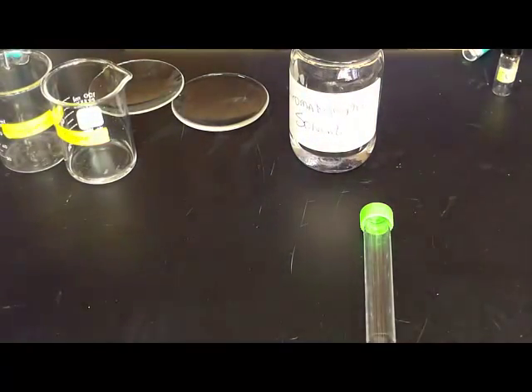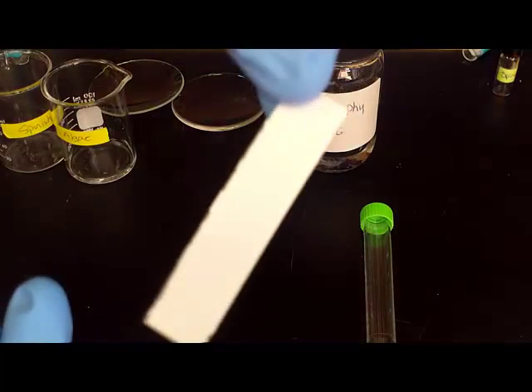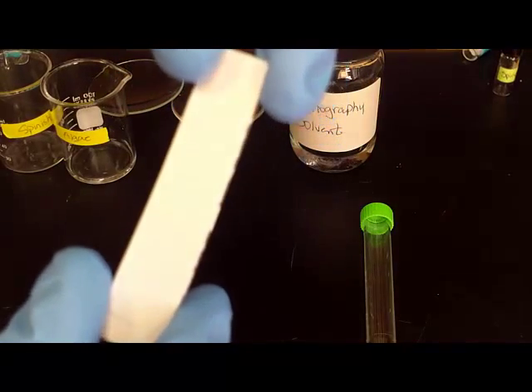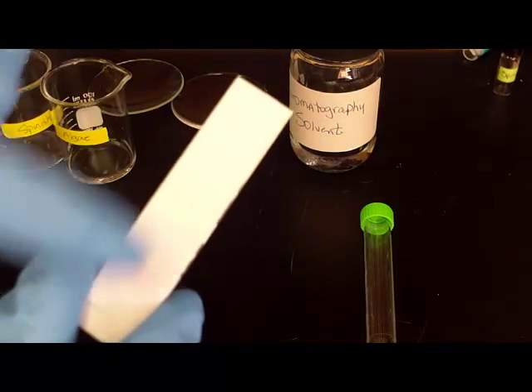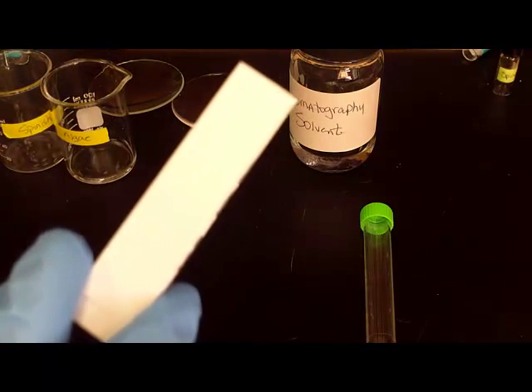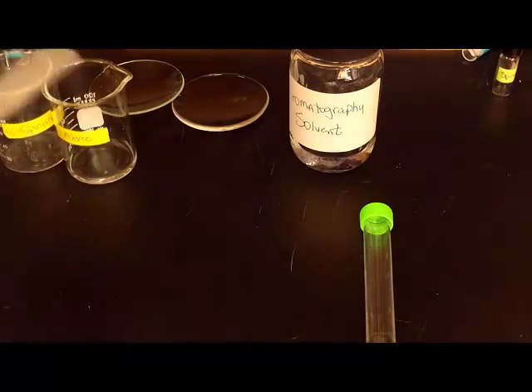Now I'm not sure if you could tell but the plates are shiny on one side and the other side is dull, and this is the side that we apply to, the dull side. So you'll do your pencil drawing on this side and you'll apply the extract to this side. If you try to put on the shiny side it will just roll right off.